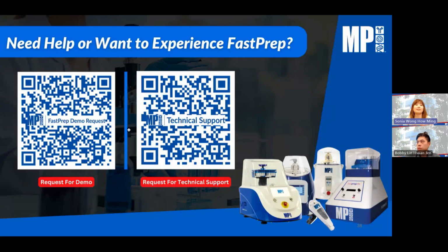Okay, I think we can also address the minimal RNA that she has. Possibly by lengthening the binding time, that could also help in achieving more yield, and also possibly by lowering the elution volume. Okay, so again, thank you, Dr. Sonia. Let's move on to the next question we have.